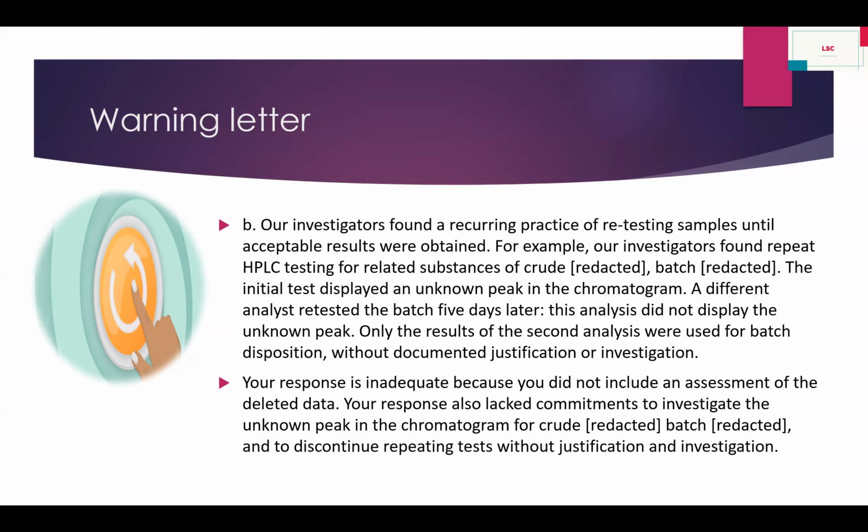It means you just do the analysis, remove that, and again do the analysis, and again you retest until you have some data. So in the risk assessment part, how can we control that? We have some traceability in our electronic data. How can we trace how much time the analysis was going on, or how much time a task of a related product or related work happened in your software? Not only HPLC, it may be QMS, it may be LMS, and all these types of software.